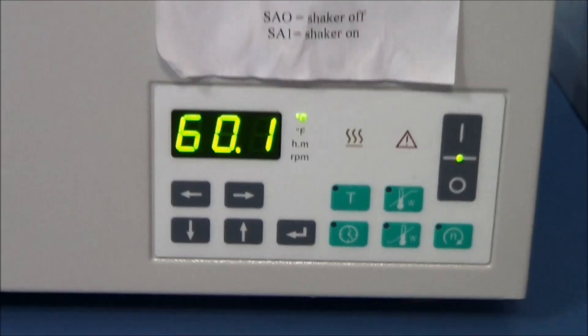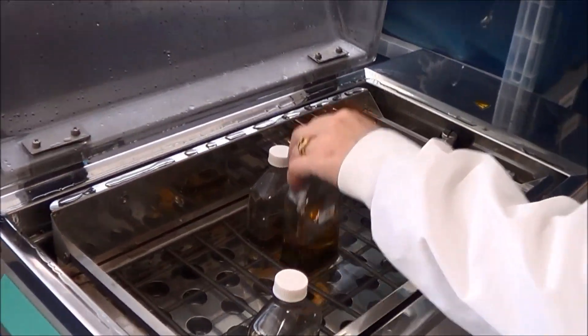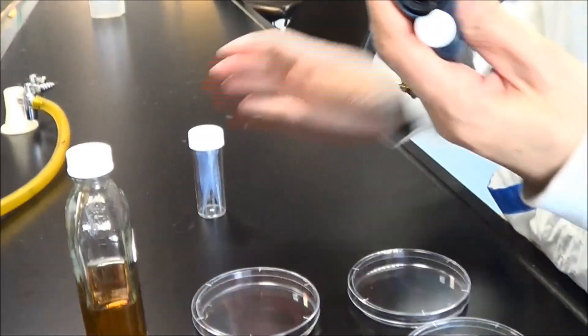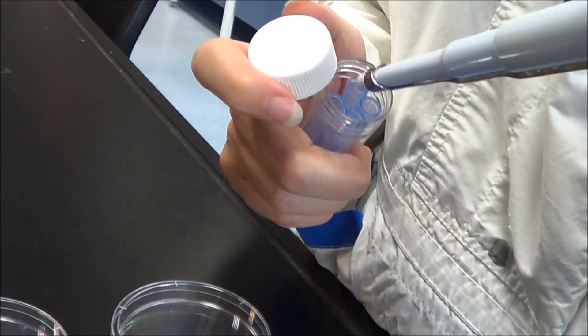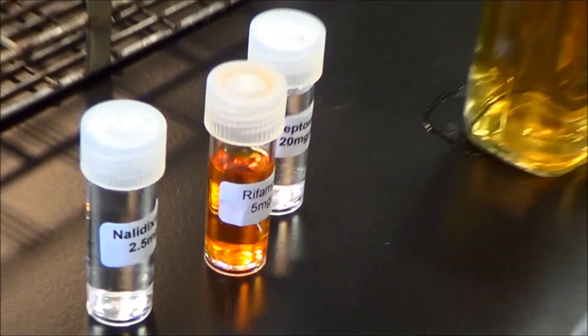The next step is to add the antibiotic to the molten agar. The molten agar is cooled down to around 60 degrees in a water bath. Now we add 1 ml of the antibiotic solution to the molten agar. The antibiotic we are adding firstly is rifampicin.